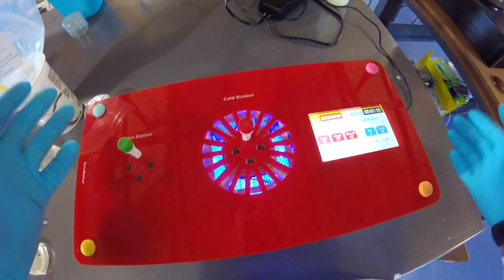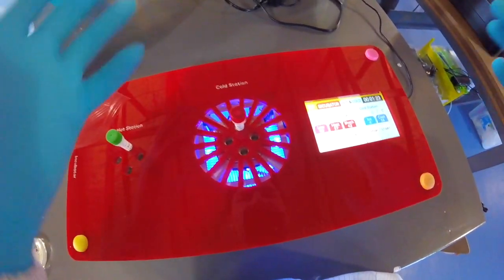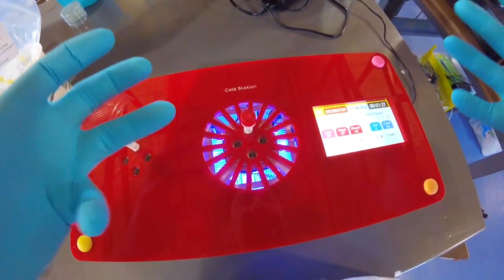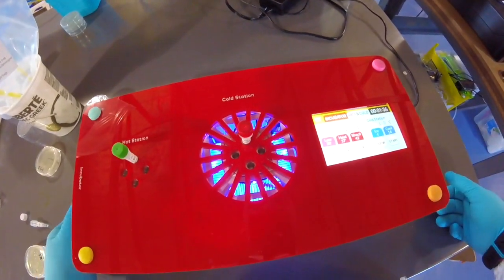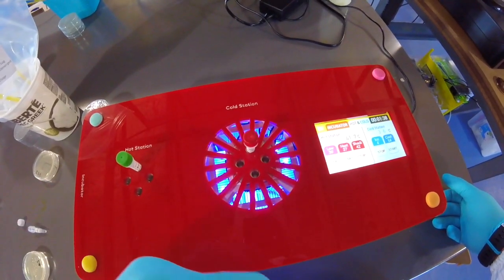and the DNA right now is kind of floating around outside of all the cells for the most part. It's mixing with some of the calcium, and the calcium helps to cause the DNA to get smaller, to kind of bind to itself, but also bind to the surface of the cells. But again, the membranes are fairly rigid because of the cool temperature.